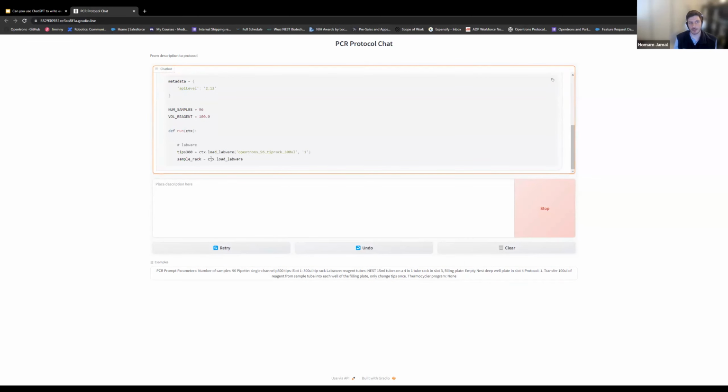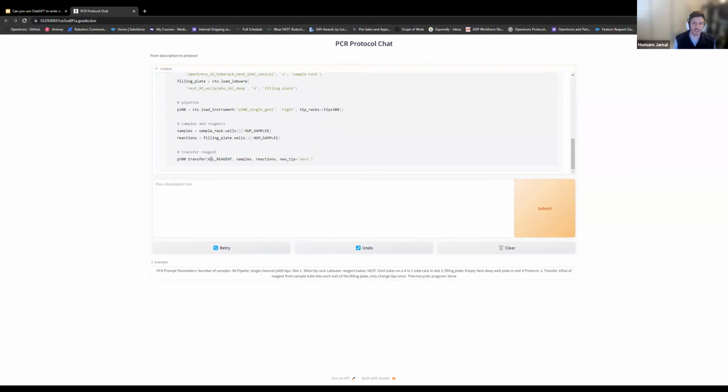I'll tell you right now that it's not perfect in any way. We're taking it step by step and giving it really simple protocols and seeing if it passes and really supervising the training here. We are fine tuning it a lot, and this is only 5 to 10 sample protocols. We actually want to expand this dramatically. We want hundreds and hundreds of optimized protocols in this model to be able to say that this is running in an optimal fashion. So a lot of testing to be done. This is very, very early stages.